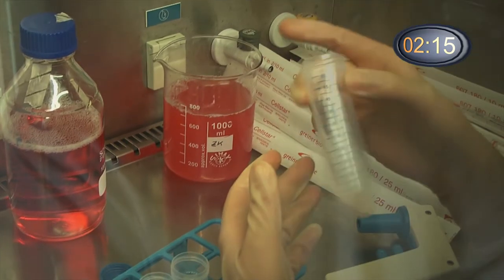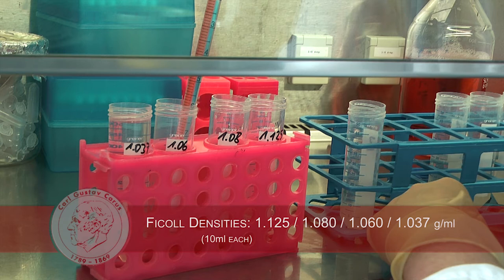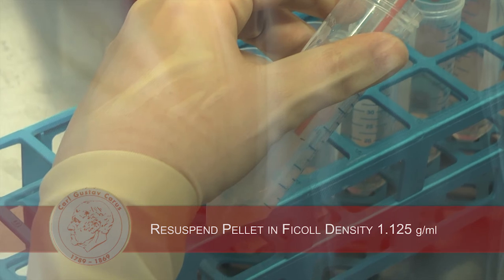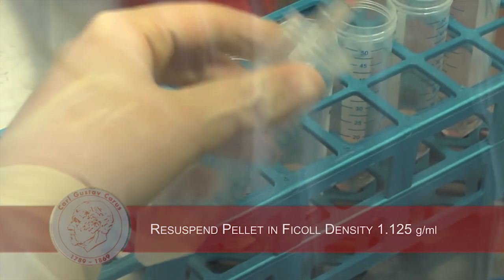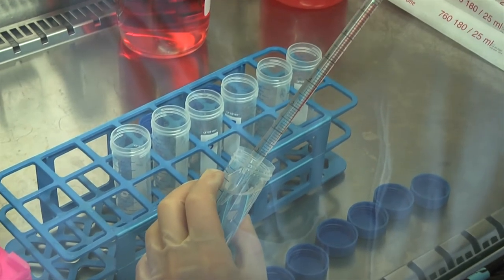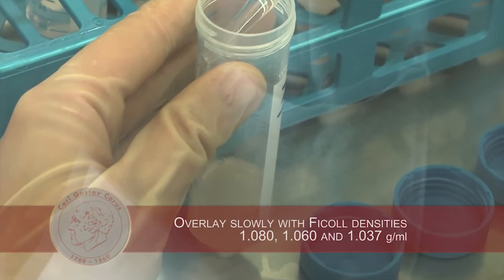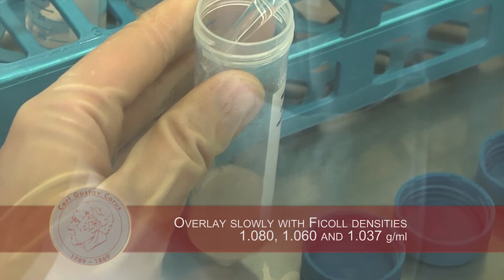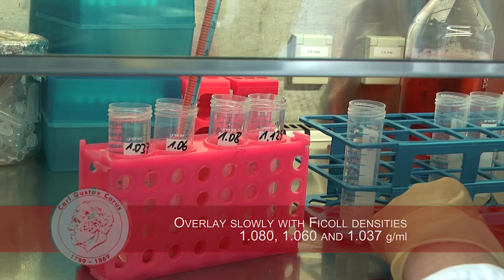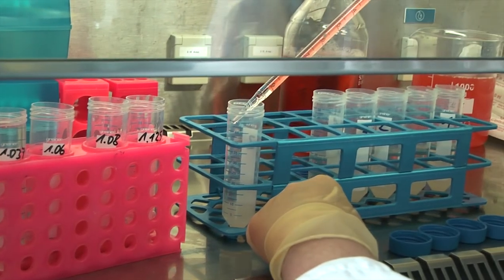For islet separation from the acinar tissue, the different tissue densities of the two parts enable the application of a Ficoll gradient. First, we resuspend the pellet in Ficoll medium at density 1.125 g/ml. The pellet must be small enough to allow for homogenous resuspension. Next, we slowly overlay this with the Ficoll media densities 1.080, 1.060, and 1.037 with a volume of 10 ml each.